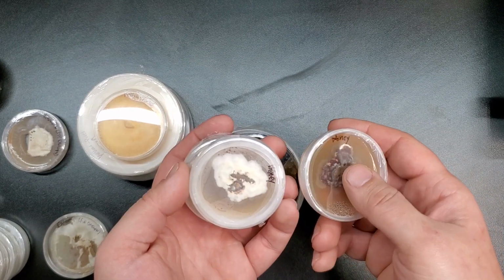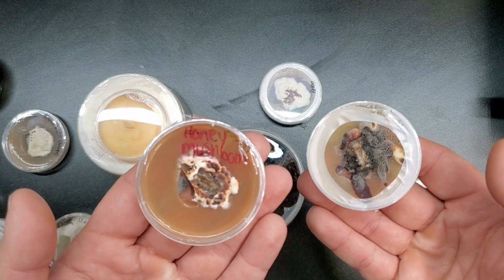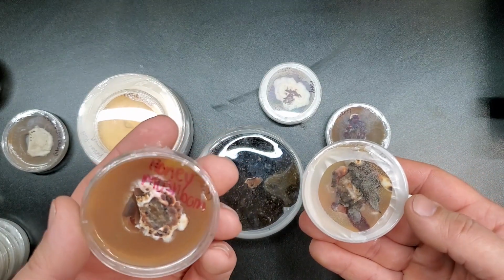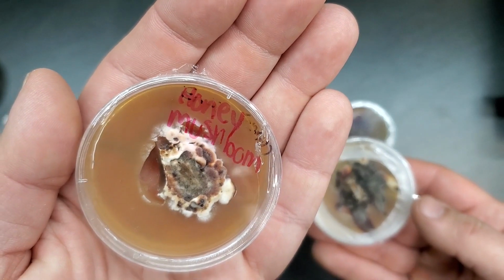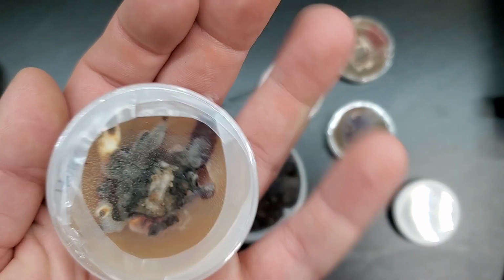But you can see that it's been quite a while. And the honey mushroom tissue samples look pretty different from one another, but they're all really healthy. They seem to grow very, very slowly compared to other species that I've dealt with here. But they do have a really interesting growth pattern in them, especially this plate right here. This is really, really cool.